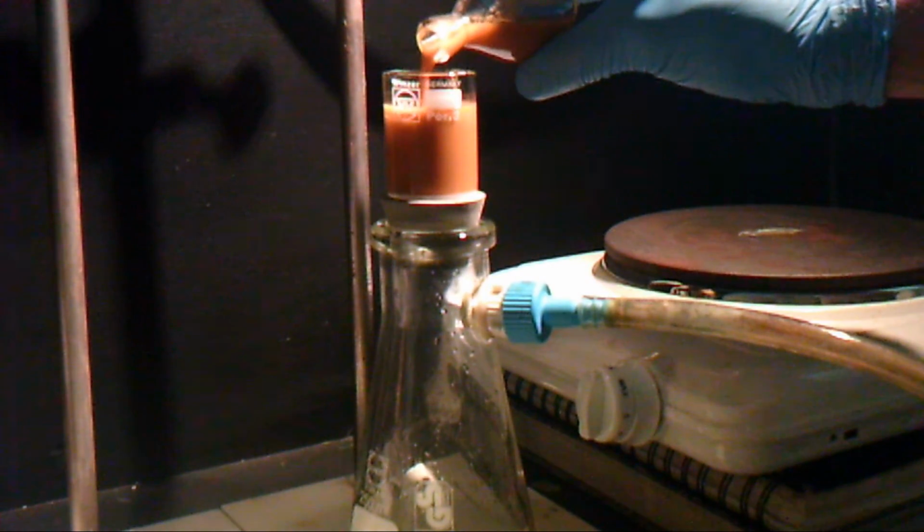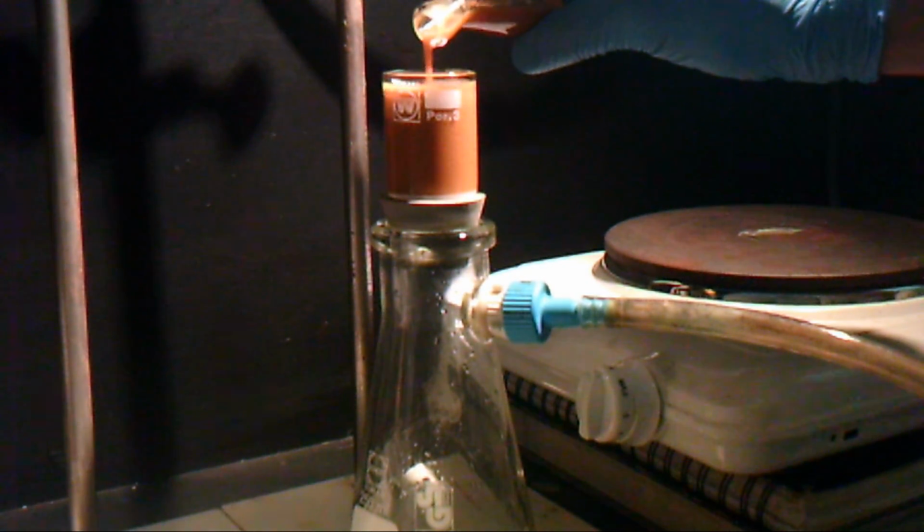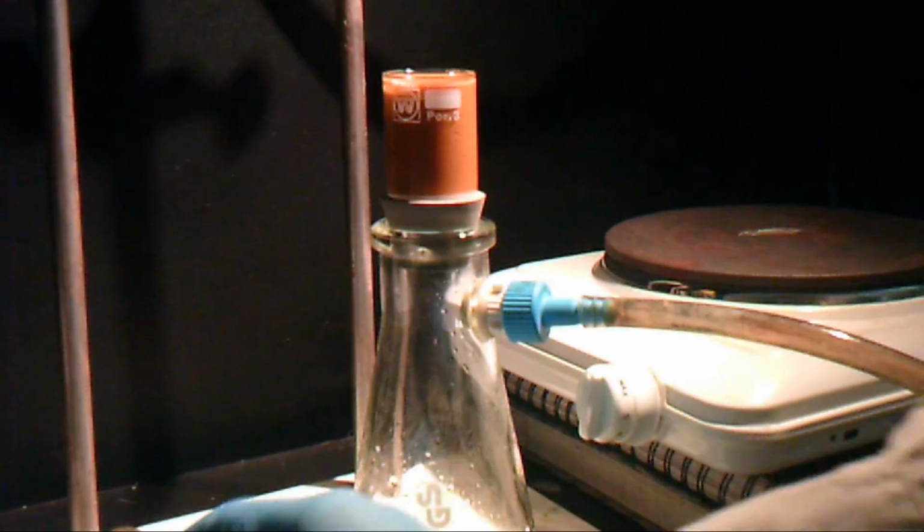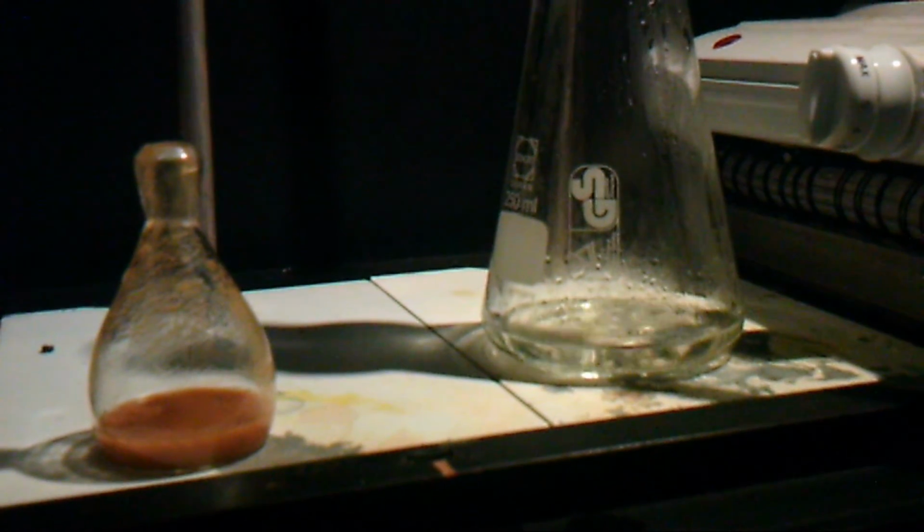This way you will have smaller loss. As you can see, the filtrate is very clean, which indicates that no copper ions are in there, or not many at least.